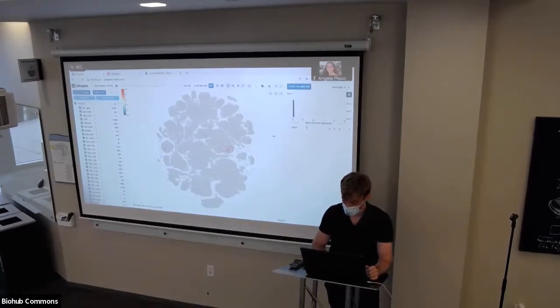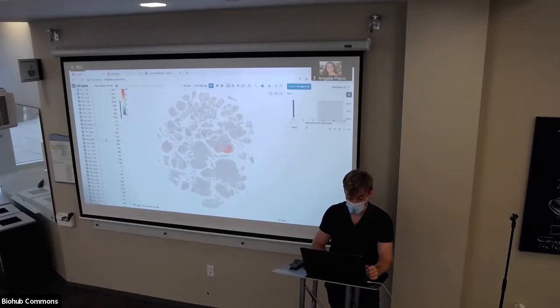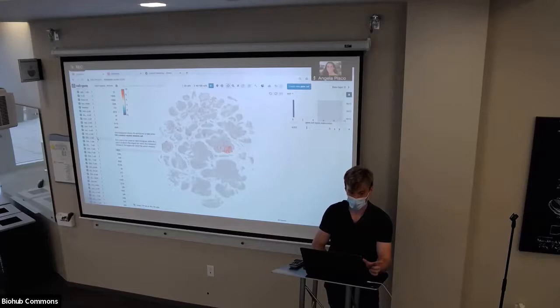And then we'll try to brush for high expression. So what we'll do is we'll brush these guys up. And so it would be nice to have, when you're coloring by the gene expressions, this is also something CZI implemented, a histogram of expression within each, instead of the stacked bar plot. But because there are so many zeros, as ACE2 is kind of sparse in the data, this all just looks like a bar, so it's kind of useless.